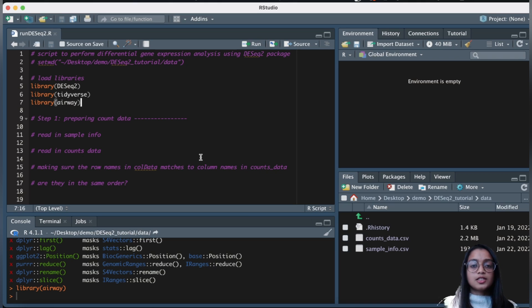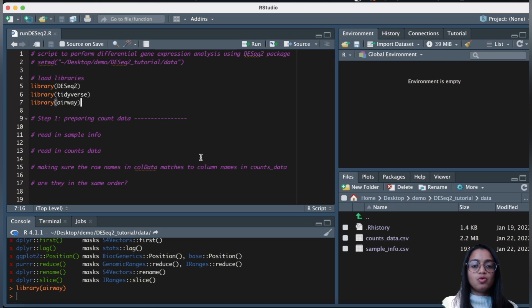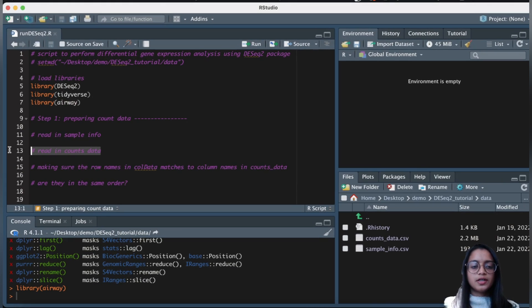Before we read in our data, this workflow has three major steps. The first step is to read in the data and get it in the right format. The second step is to create a DESeq dataset. The third step is to run the DESeq function, which essentially performs the differential expression analysis. So let's first read in our count data.